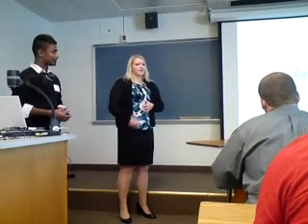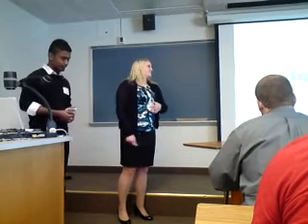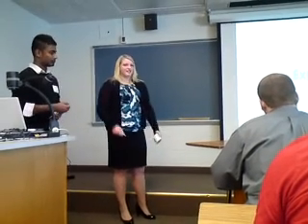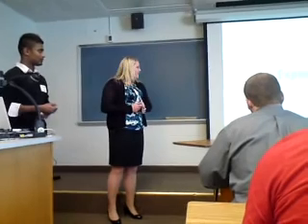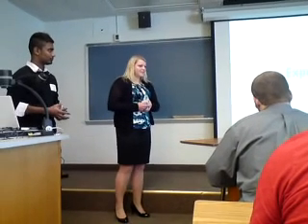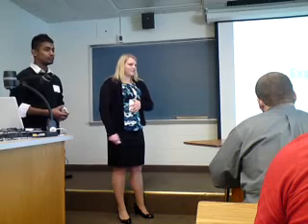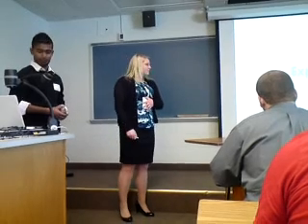Another big thing is it got really frustrating during the year. I mean, our first results, you can see we didn't have anything. So to get a gel like that, we were both pretty upset. But it's nice that we were finally able to get some results at the end, so that was exciting. And we both did learn a lot that we can use later on in our biology careers.